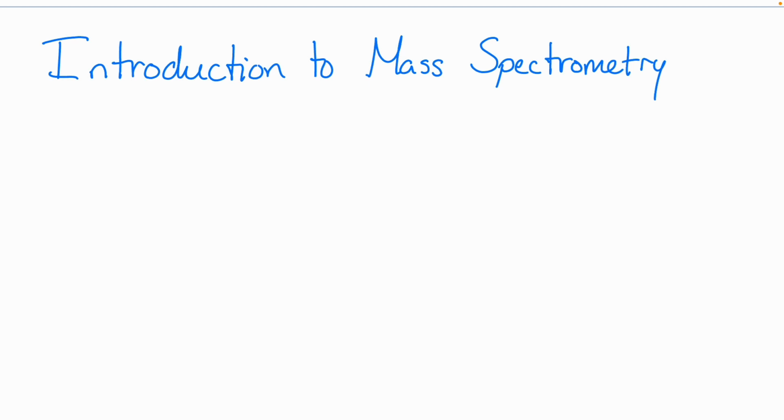So let's get started here. Today's lab is going to be an introduction to our next experimental technique, mass spectrometry. We're going to learn some background information, get some theory laid out, but then also take some practical notes on how to go about analyzing these spectra.